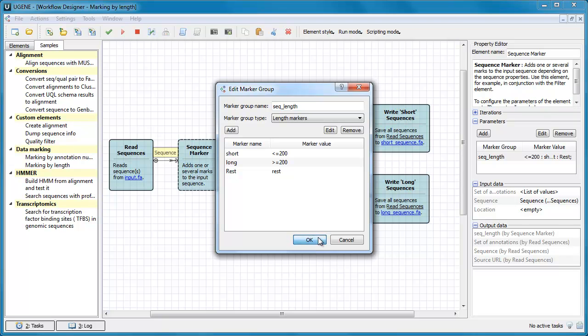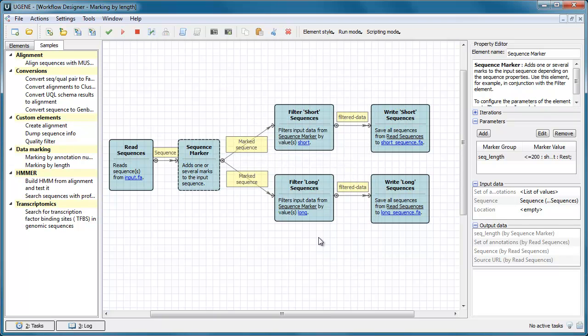The Filter element, in conjunction with the Sequence Marker element, would allow one to filter the input data by these marks.